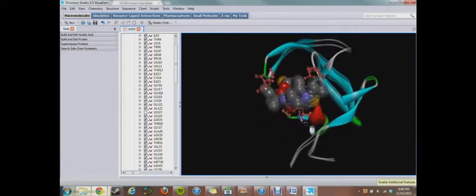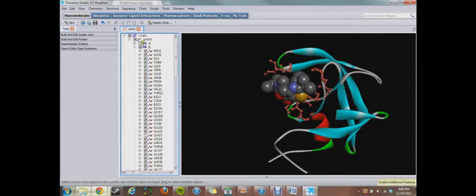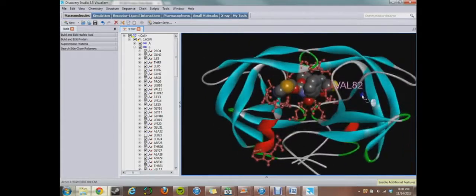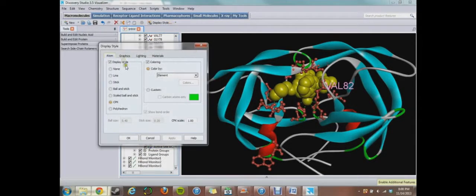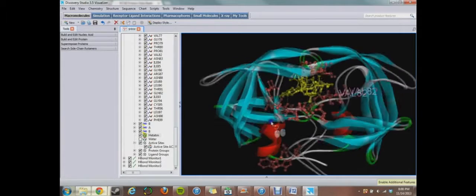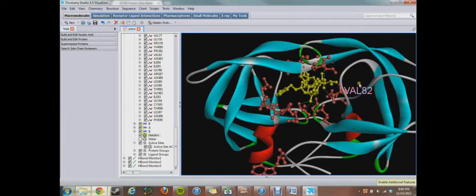You might want to add a surface to your protein, but still want to see the underlying structure. I told you how CPK gives you this space-filling model for your ligand in the middle, and you don't have to represent your ligand, or inhibitor, through that CPK. You could do it ball and stick, that's fine. That might actually be a little clearer when you're trying to show all these hydrogen bonds.